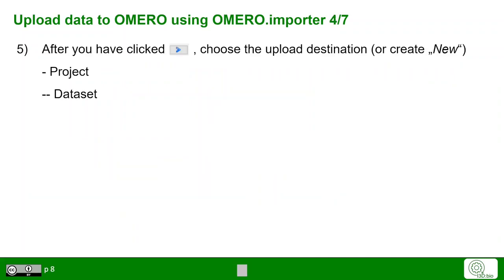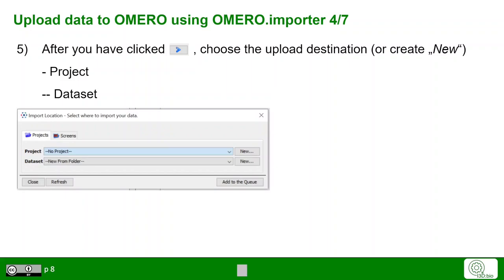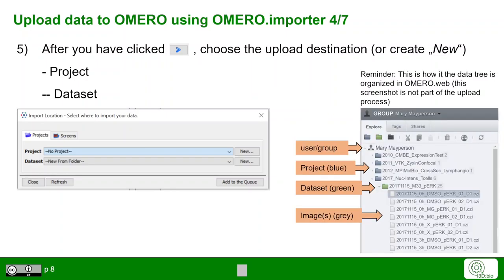As a next step, you have to choose the upload destination. You can either choose an existing project and dataset or create a new one. In this window, you can either choose one of the existing projects and datasets or create new ones.